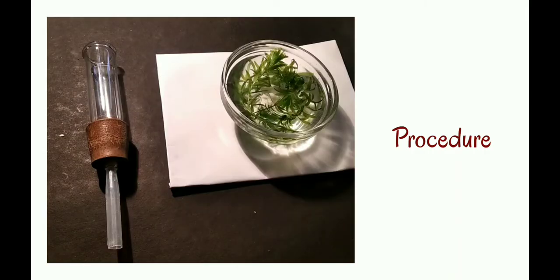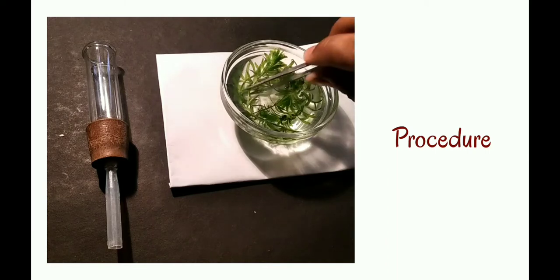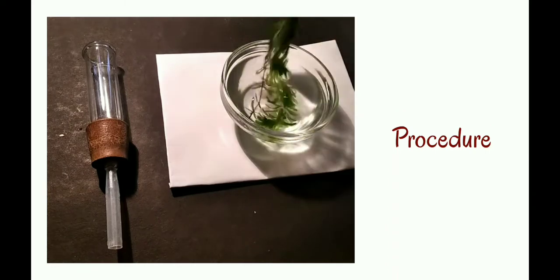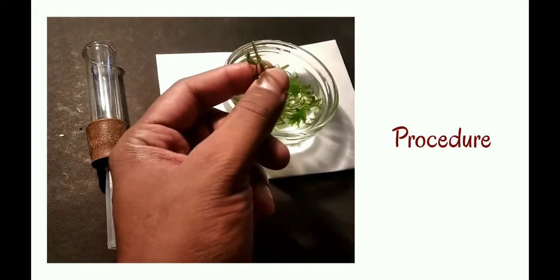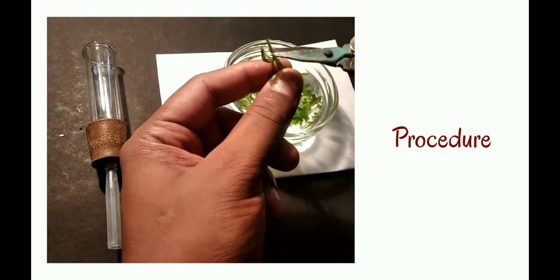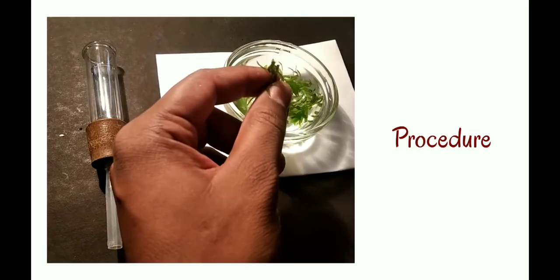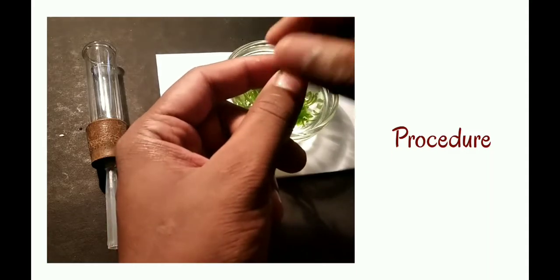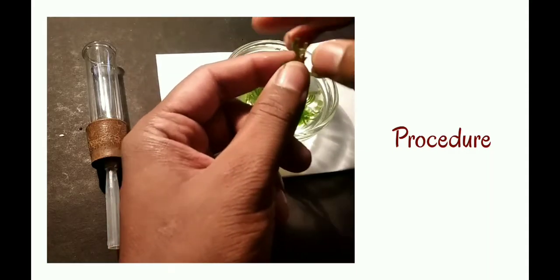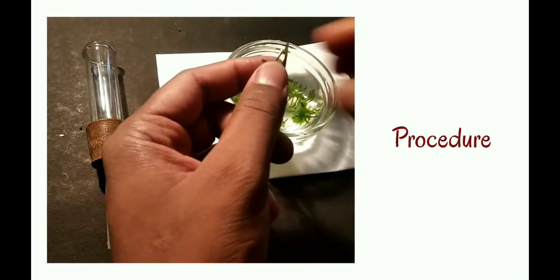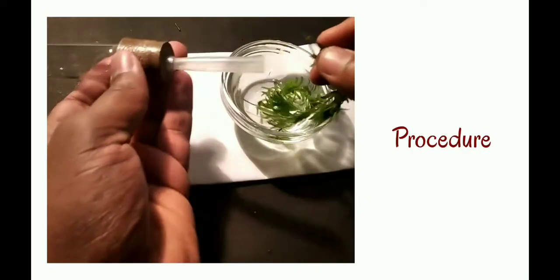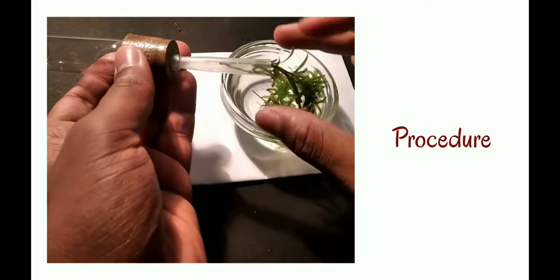Once the assembly is completed, take the Hydrilla plant and cut the lower portion of the stem with the help of scissors. Insert the cut portion of the stem into the bubbler.